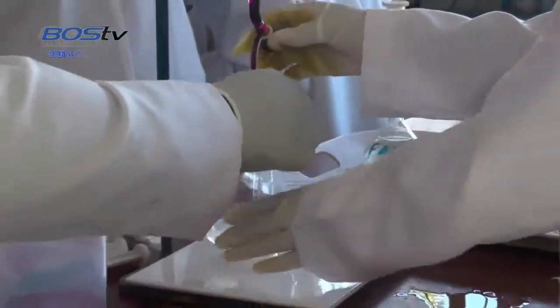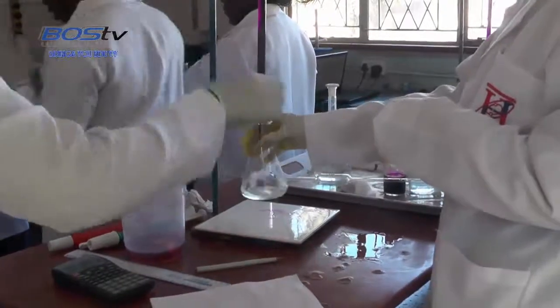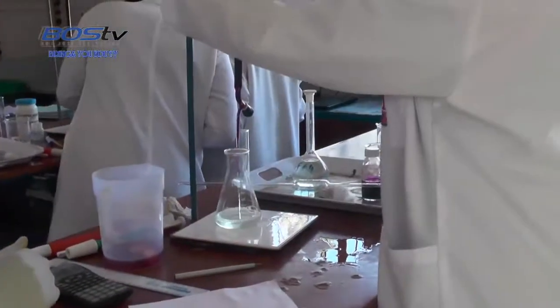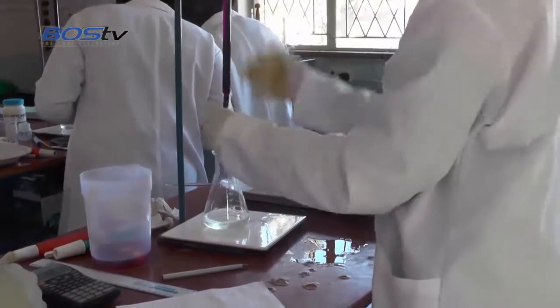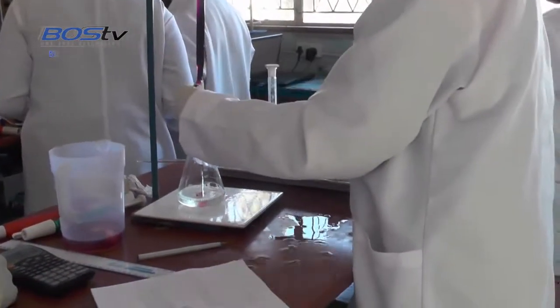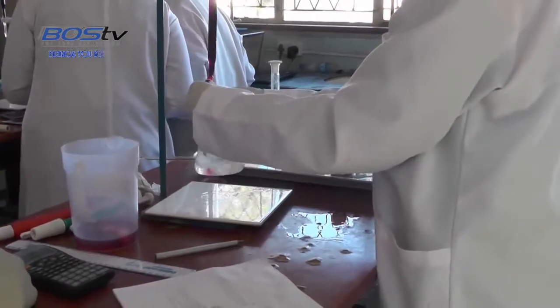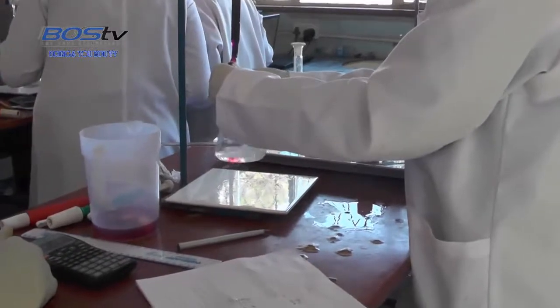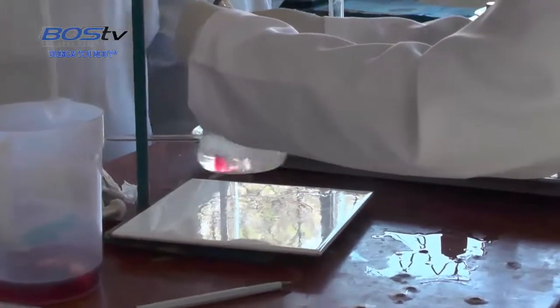Control continuously. Shake, swirl. You're nearing the end point. Then continue until you get a faint pink colour.